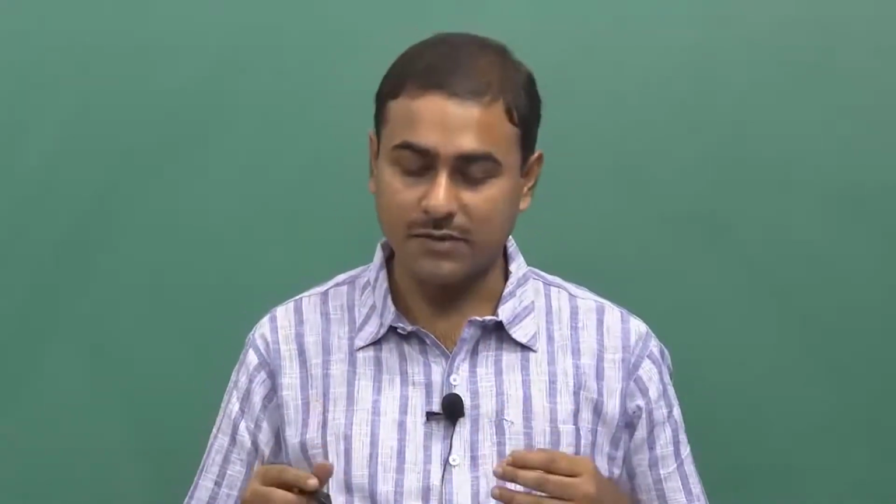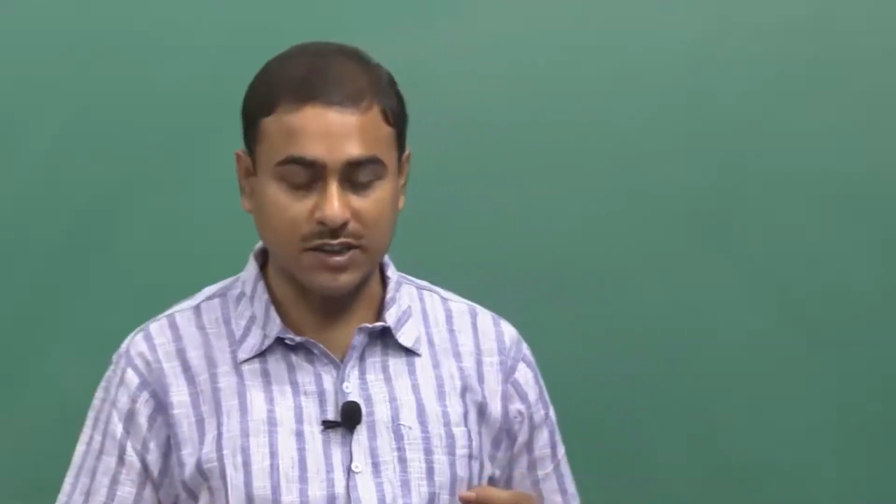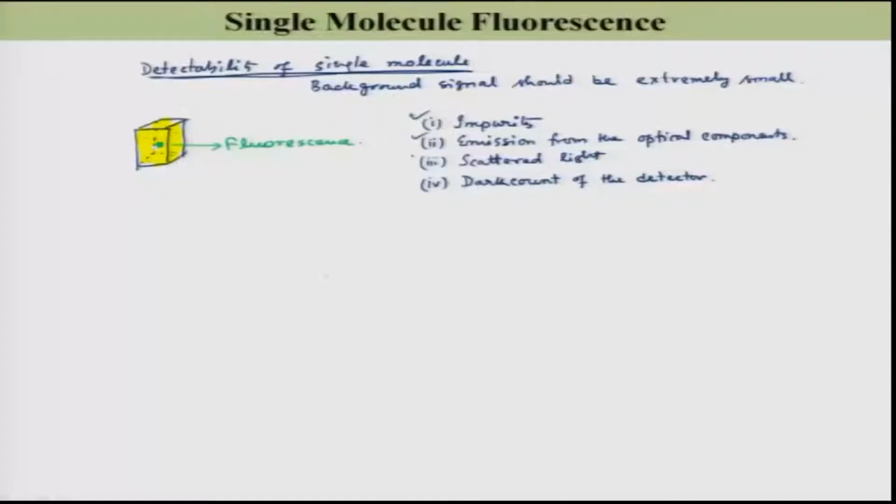Now, consider that you have a sophisticated instrumentation laboratory and sophisticated purification facility, so that impurity is taken care of, emission from the optical components is taken care of, scattered light is taken care of, and the dark count of the detector is also taken care of.